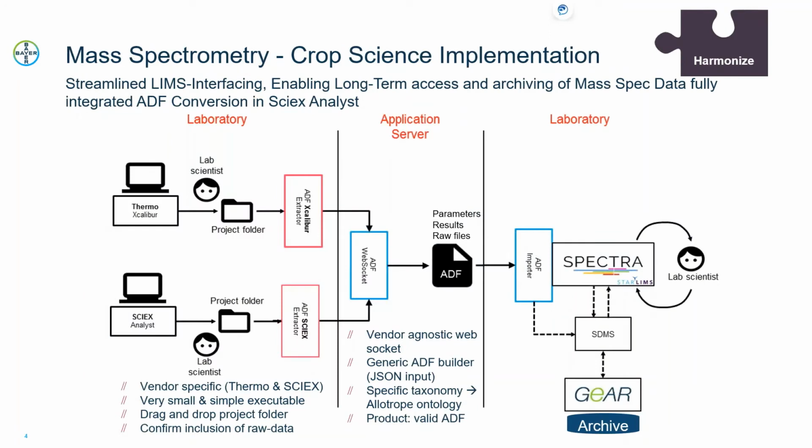And I'd like to show you the context where we embed this. This is one implementation that we have at Crop Science. There will be others in the pharma space as well, where we try to streamline the LIMS interfacing in general, decoupling from bilateral interfaces towards standardized interfaces using the ADF as the import format for LIMS. In this case, the StarLIMS use case in Spectra. This is a use case from the Human Safety Residue Analytics LIMS.